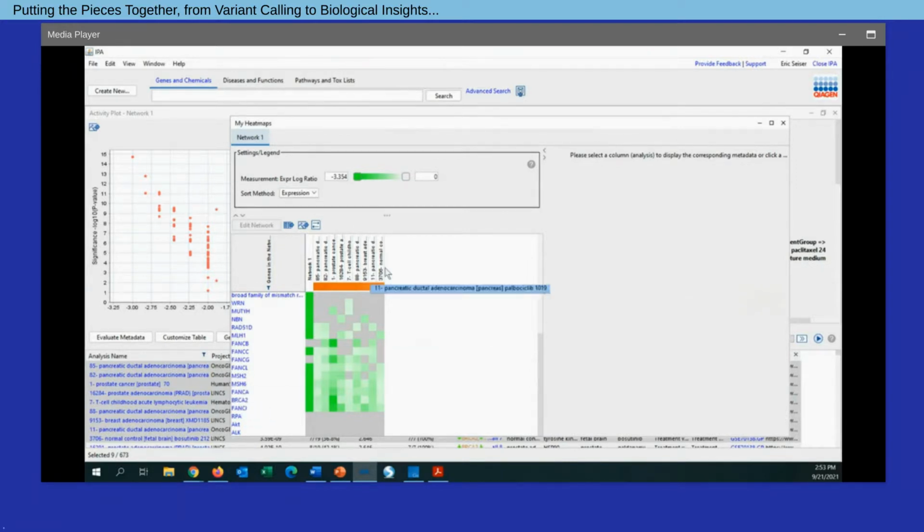And very interestingly, across these studies, again, different cancers treated with DNA damaging agents, we see that these genes, in fact, show a decrease in expression. So the green cells across each of these different columns. So now I have some insights and I can explore this further. When we talk about public comparisons, we have lots of different comparisons available in the context of, as we're looking at here, many treatment-based studies, but also disease versus normal, responders versus non-responders. But hopefully this represents a way in which we can integrate loss of function information from a variant-based study to gene expression patterns within public data sets.